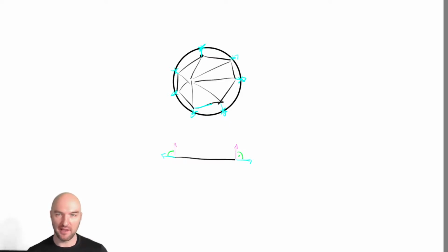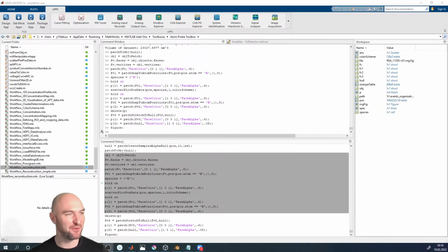Okay, so now we have a fairly nice grain boundary that we've outlined. The only thing that's maybe a little bit uncool. Let me just plot the grain boundary separately in a new figure. You gotta switch your screen. Oh, thank you. I will never remember to do that. But that's what I have you people for.